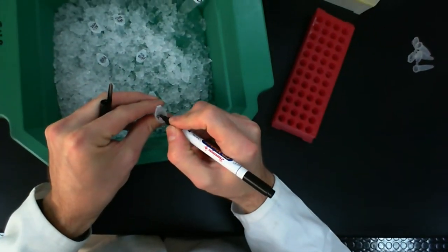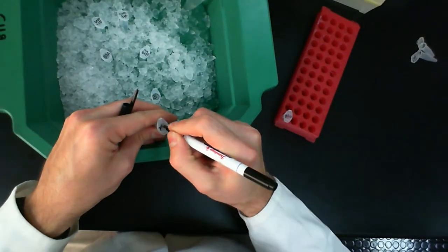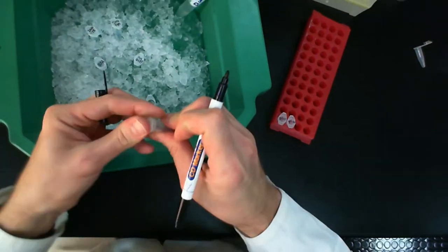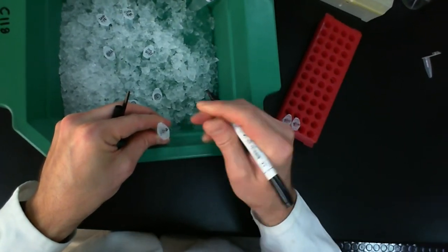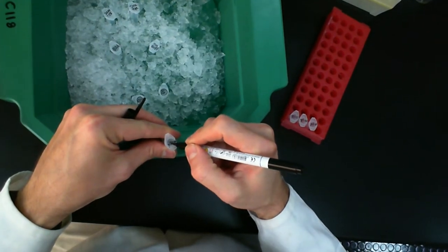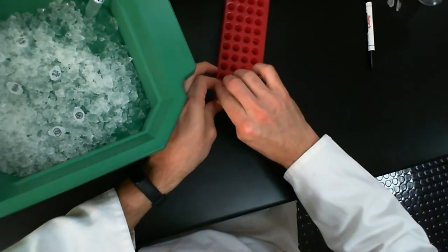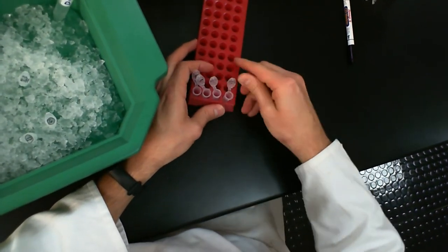So this is P1, plasmid 1 with enzyme, so P1-E. This is P1-negative, P1-N. And this is P2, plasmid 2, that's your TER, P2-E, and P2, plasmid 2, negative. This is going to be the one that does not get enzyme. So here they are, ready to go. I'm going to open these up and get them ready for action.